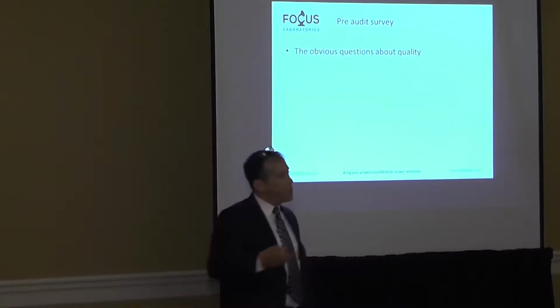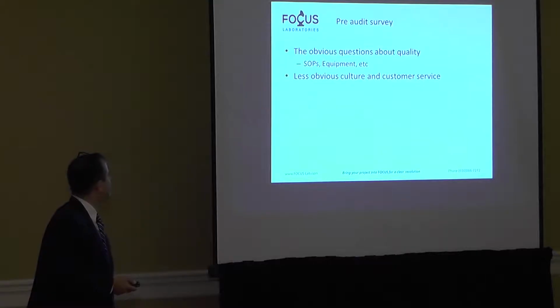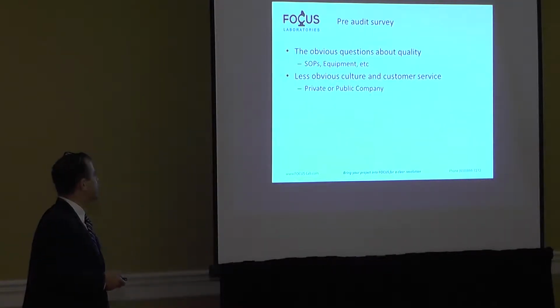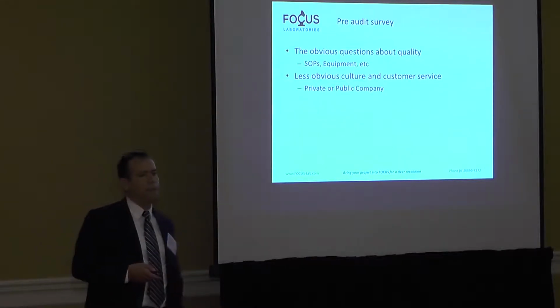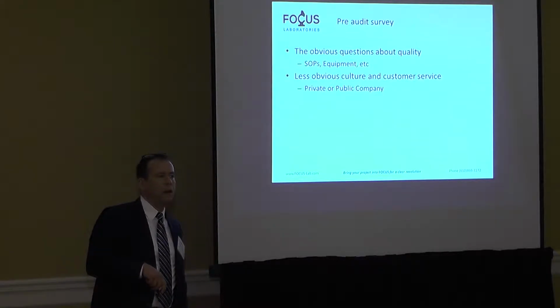Okay, so before you go, you're going to have a pre-audit survey. There's some pretty obvious questions, SOPs, equipment, which we already talked about. What about culture and customer service? It might be interesting to know, are they a private company or are they a public company? I've worked for both, and there's plusses and minuses for each.